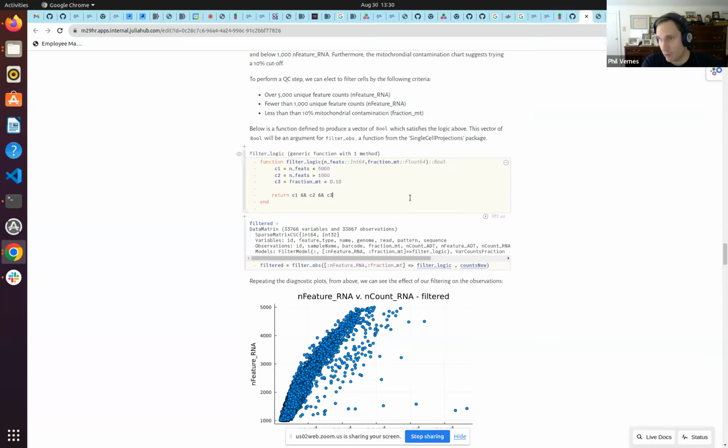That matters a lot, because if I'm looking at, say, contamination or other properties of cells, and it just so happened that I filtered that whole cell out and I don't account for those changes in my filtering, right? I think people understand what I'm talking about. I've got to keep my debits and credits, so to speak, consistent.